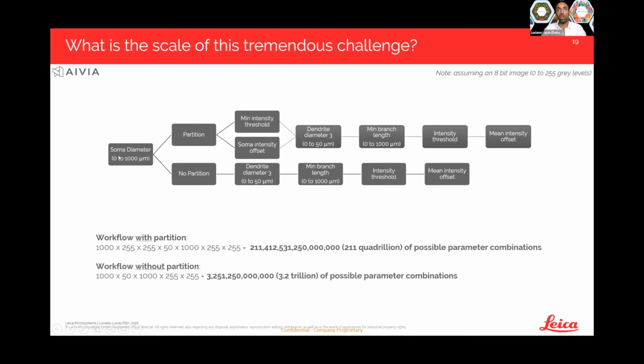So that's a non-machine learning approach to doing image segmentation, in this case for neurons. It is what I would say the vast majority of the life science community still does today. And it's repetitive. I could plug in an ImageJ plugin here. It would be a similar problem. I quickly calculated here that this gives something like 200 quadrillion possible parameter combinations. It's a ridiculous amount of combinations.